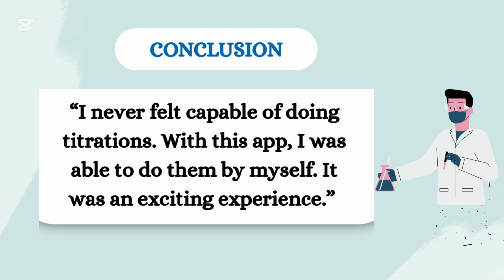The testimony of one student who benefited summarized it clearly: "I never felt capable of doing titration. With this app, I was able to do them by myself. It was an exciting experience." Inclusive science is more than a trend, it is a necessity. This tool marks a step in that direction, opening the door to more innovations that allow everyone to learn by doing, regardless of their visual limitations or their barriers.